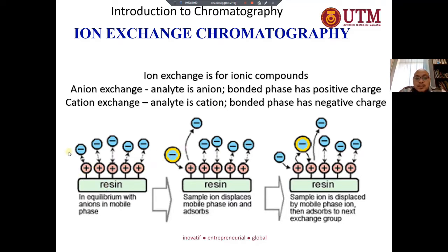If you look over here, the bonded phase is positive. When the bonded phase is positive, the analyte of interest must be negative, which means our analyte is anionic. When our analyte is anionic, then the system is for anion exchange.